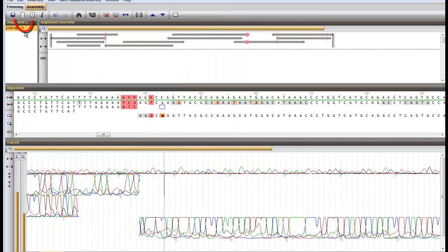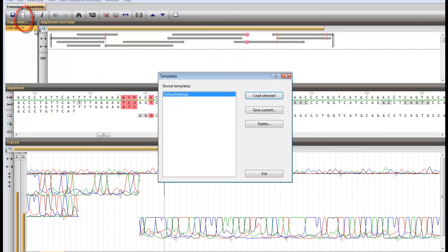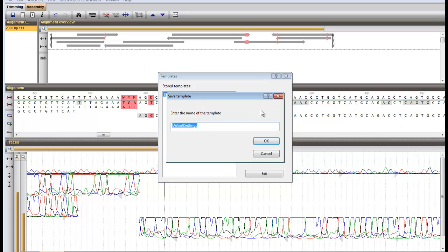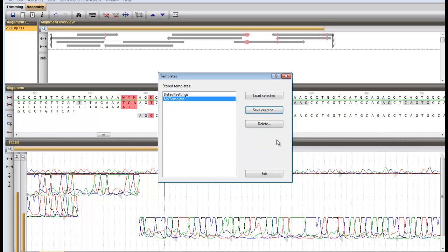Click the Templates button and press Save Current. It is now available to be loaded in a future project.